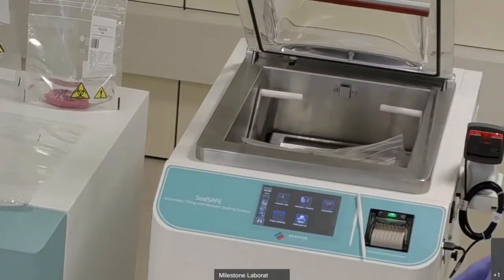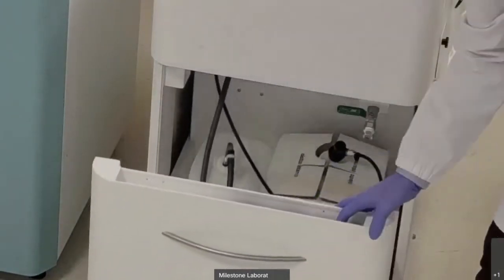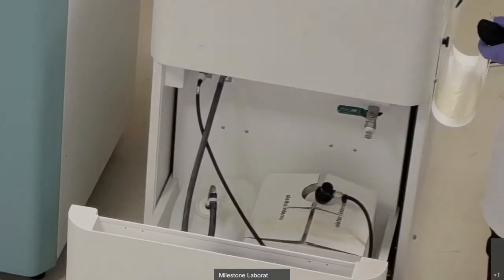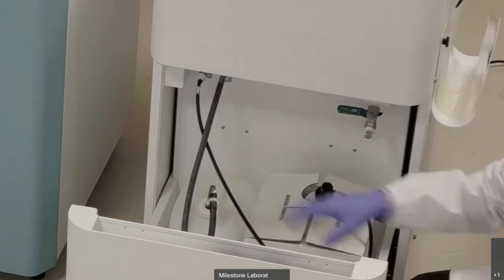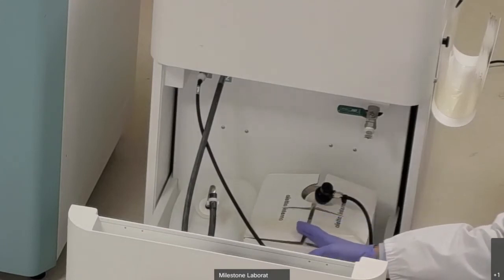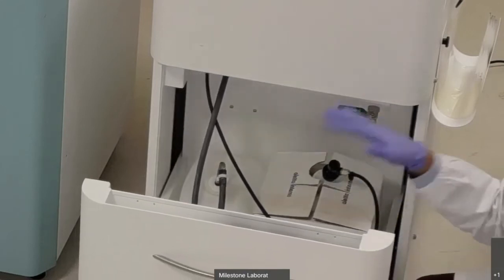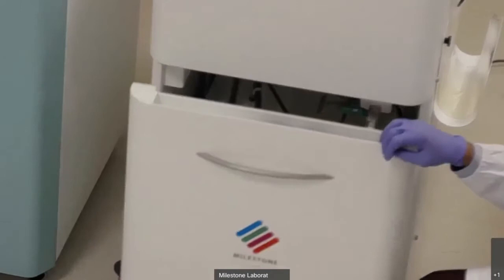Here, since we are already here, we do have the drawer, which is a ventilated drawer, from where you can load the reagent into the cavity. The point here is that you can load any kind of commercially available tank. Here you have a Cubitainer and a 5-liter tank. Again, this drawer is ventilated, for user safety.